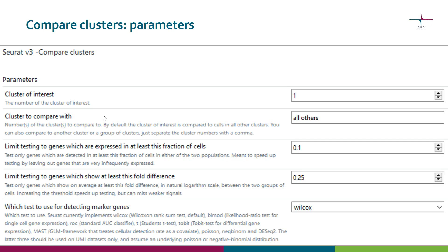Looking at the parameters for the compare clusters tool: first you need to specify the clusters you want to compare — here we have cluster one versus all others, but you could equally say two versus three, or seven versus one, or any combination. Then you again have the same parameters for limiting the testing in different ways and for selecting the test to use.